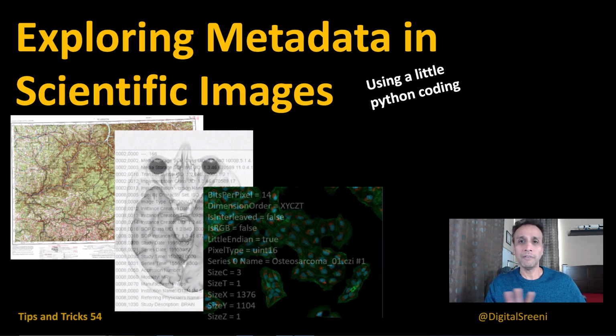And don't worry, even if you are not a coder and you don't want to do anything with coding, you will find this video to be very useful. Code will happen occasionally in the middle, but we are going to focus on understanding metadata, primarily from various image formats. The common ones: JPEG, TIFF, GeoTIFF, and OME-TIFF, and a proprietary format from a microscope company. You're still here, so I hope you're interested in this content. So let's jump in.